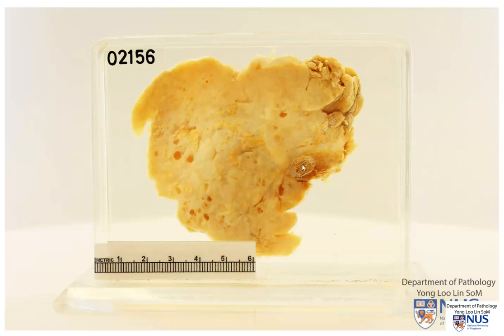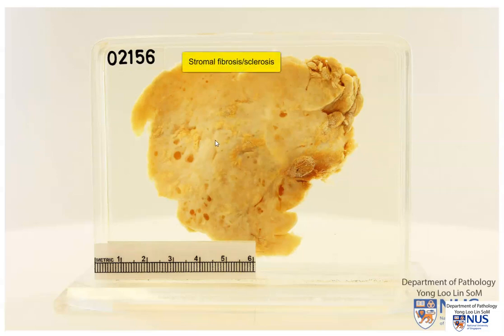The color has changed a little bit because of prolonged fixation in formalin. Now when we look at the cut surface there are some features to note. First of all, you can see this whitish appearance here — these are areas of sclerosed or fibrosed stroma. In between this we can see the fatty or adipose stroma, which is normal in the breast.